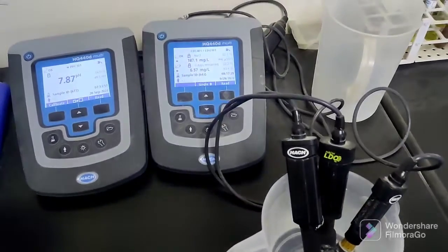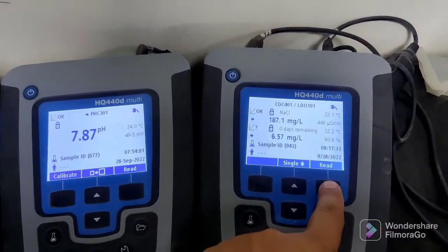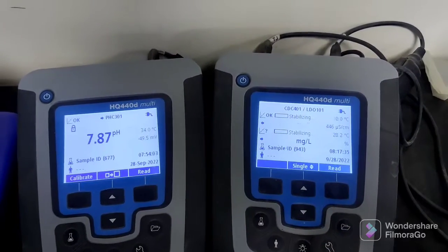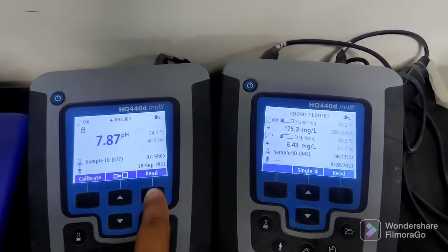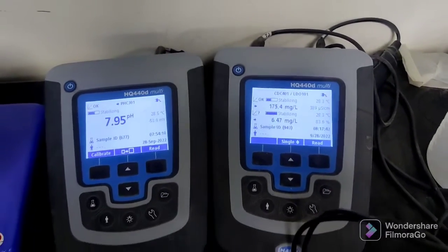Now you can see — we will just push this button to read. For the pH meter this is a separate meter. You can start it now — push the button and you can see the reading now.